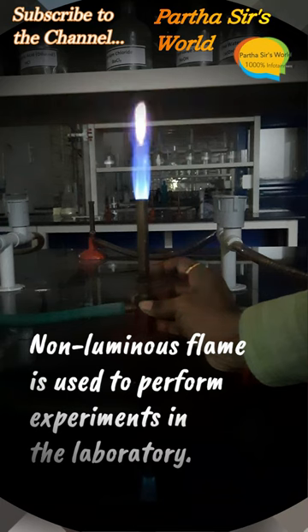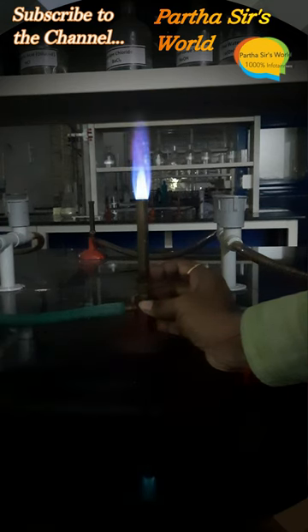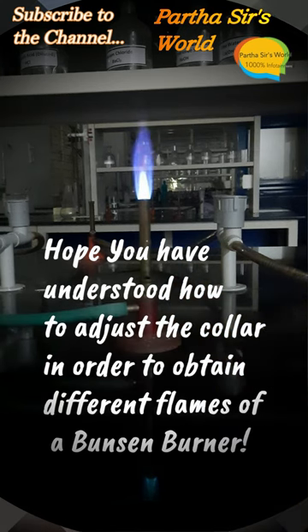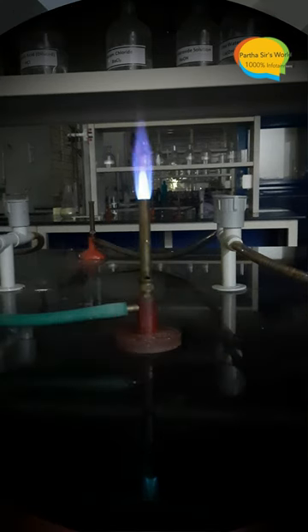The non-luminous flame is used to perform experiments in the laboratory. Hope you have understood how to adjust the collar in order to obtain different flames of a Bunsen Burner.